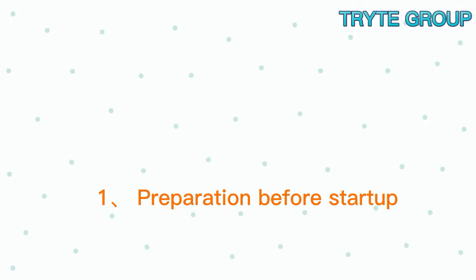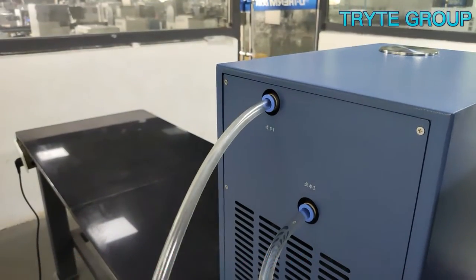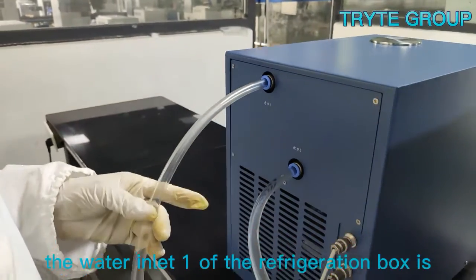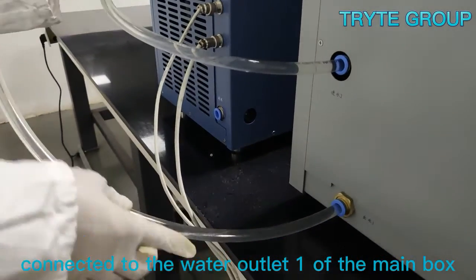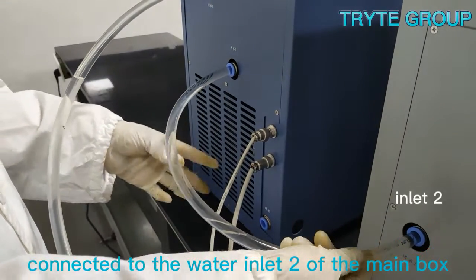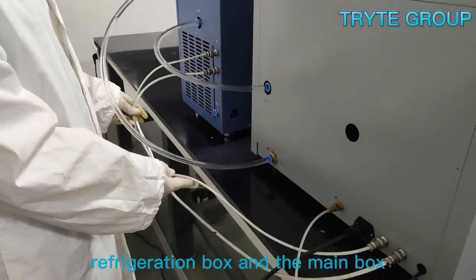Operation process — step one: preparation before startup. Before use, we need to connect the pipes of the instrument. According to the marks on the instrument, the water inlet one of the refrigeration box is connected to the water outlet one of the main box, and the water outlet two of the refrigeration box is connected to the water inlet two of the main box. Then connect the two connecting lines of the refrigeration box to the main box.